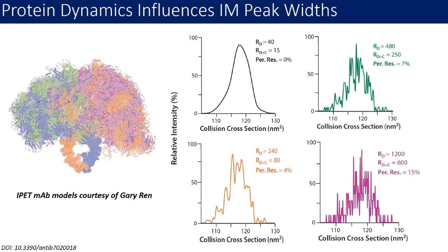Again, if we're dealing with these dynamic entities with lots of potential microstates involved in their structural ensemble, then collision cross-sections become a really challenging place to exist when one wants to pull out details of the tertiary structures of biomolecules.